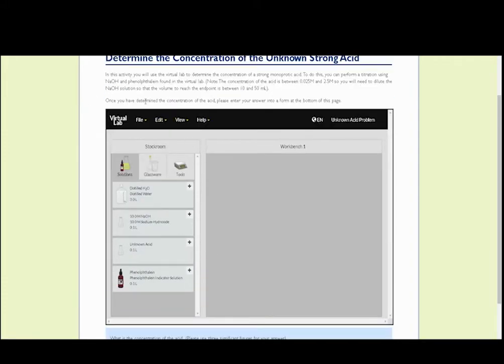So I'm only going to go over one lab today, but if you follow the procedures I did for this lab, you can incorporate them into the other ones. I'd say they're pretty similar. Some of them involve adding a solid, which you have to weigh, but there's going to be some variance between all the labs. If you can understand the basic principles, you should be able to do the rest yourself. So that's me going over that for you today.